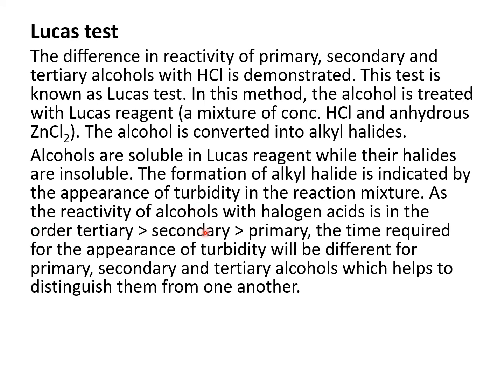The reactivity of alcohol with halogen is in the order of tertiary faster than secondary and faster than primary. The time required for the appearance of turbidity will be different for primary, secondary, and tertiary alcohol, which helps to distinguish them from one another.